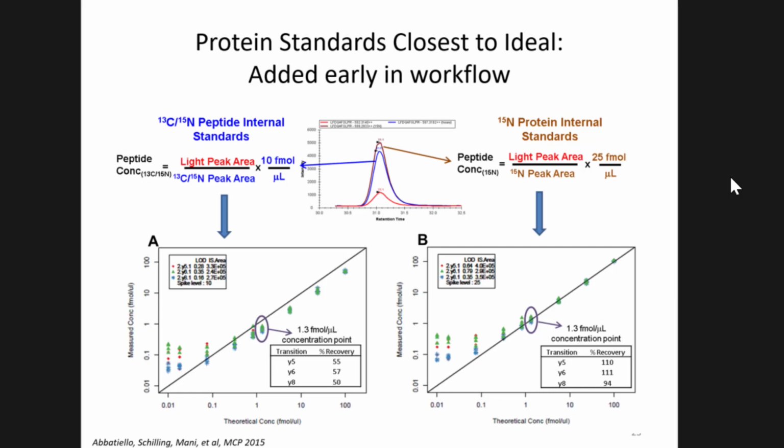You have fewer problems with impurities, right? Proteins come from an expression or something. You have way more problems there with amino acid analysis. I think it's dependent upon where the protein comes from and how it was handled before amino acid analysis. I don't think you would just take it; I think you would want to purify it, right? Because if you're purifying a stock, you would want to make sure the stock is pure before getting the concentration of it. Otherwise, it's kind of useless information, right?